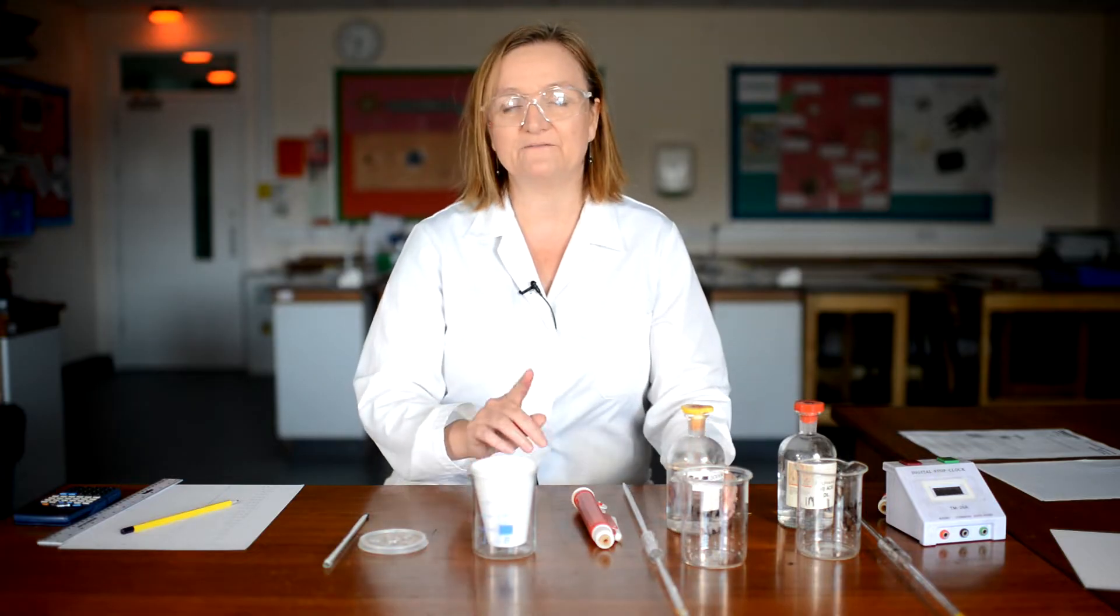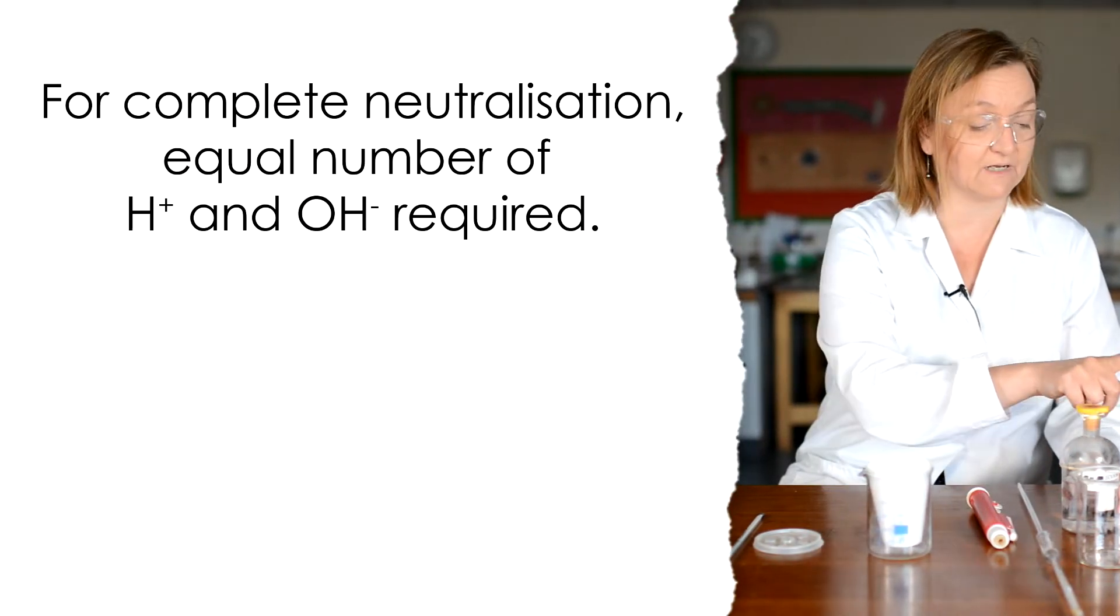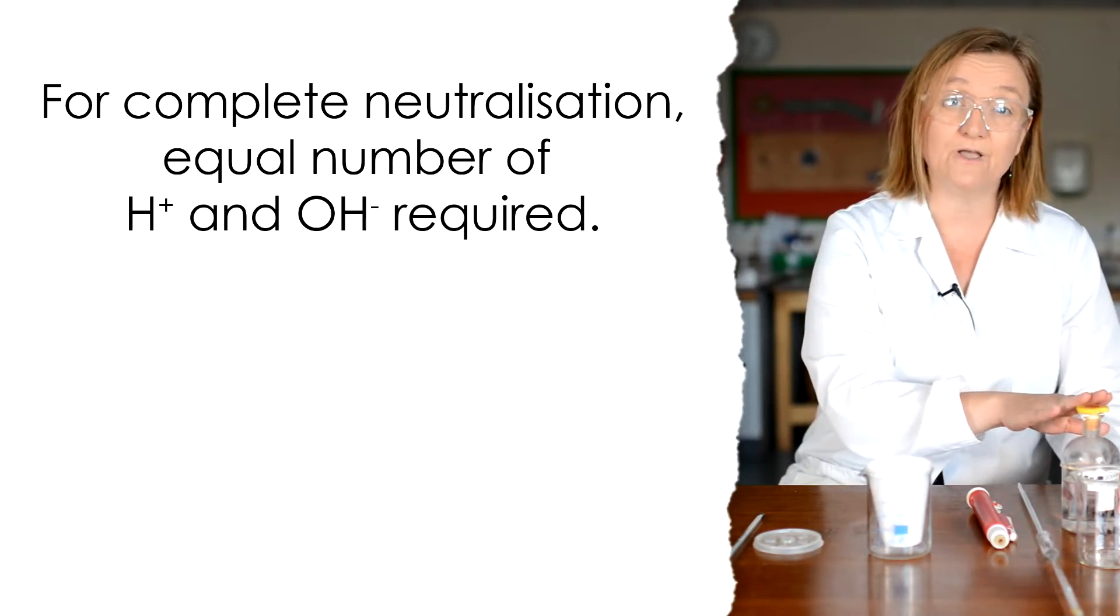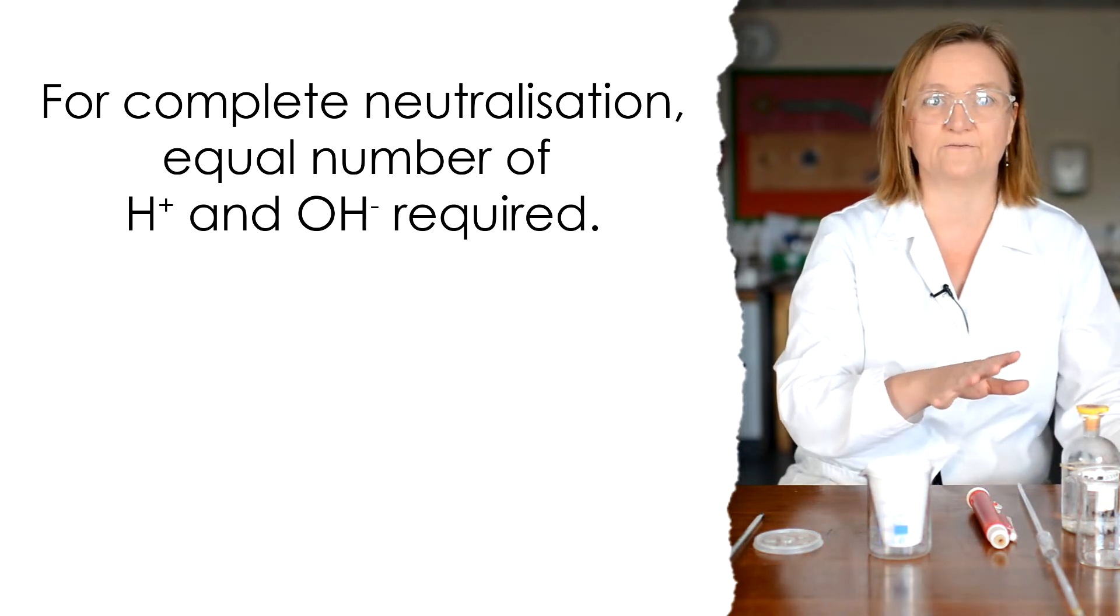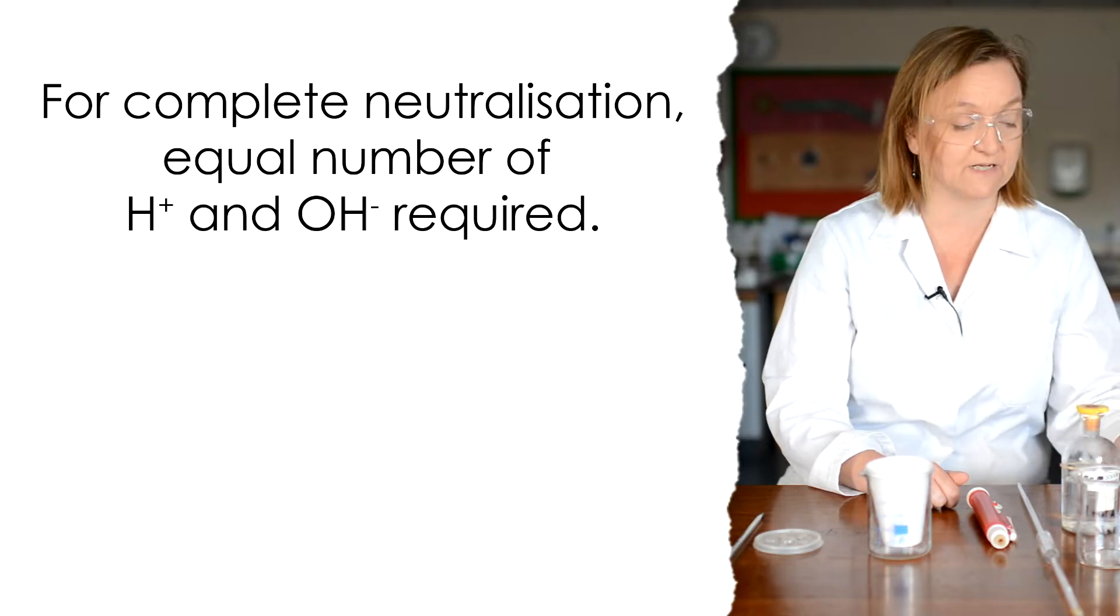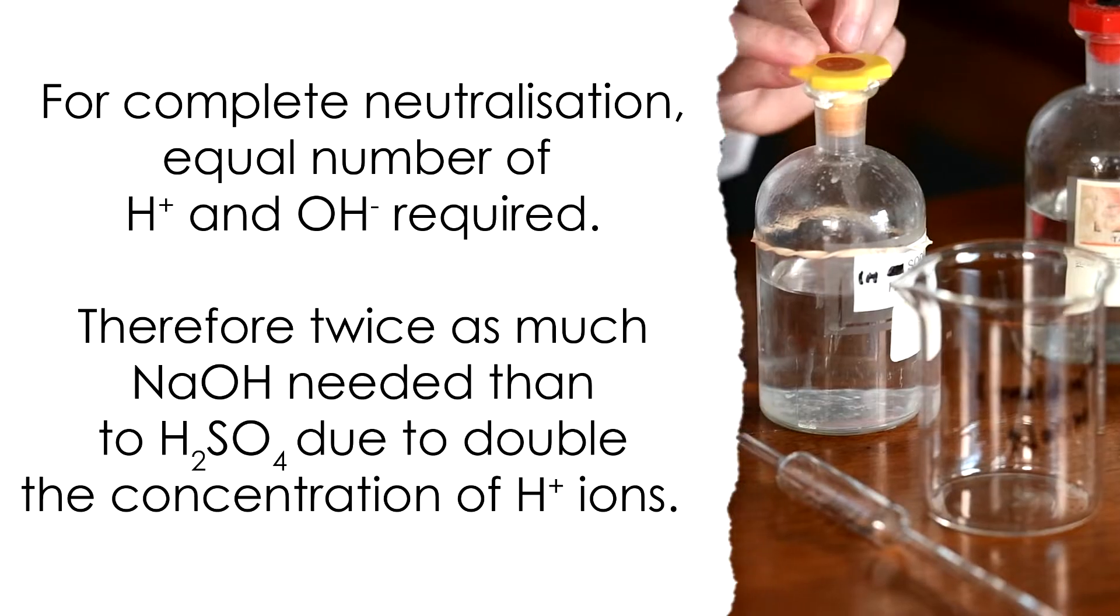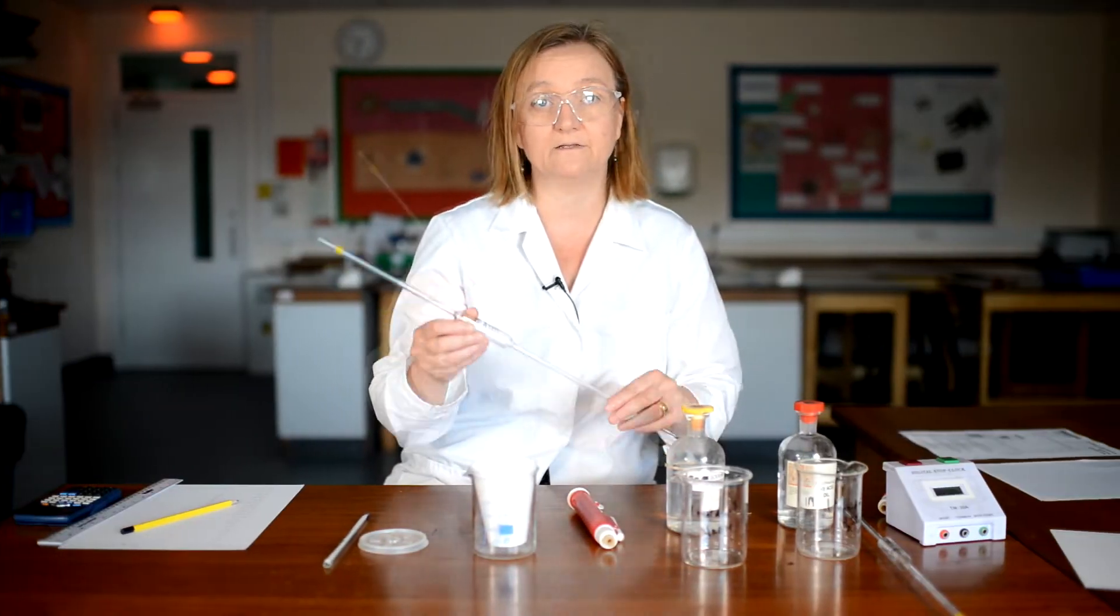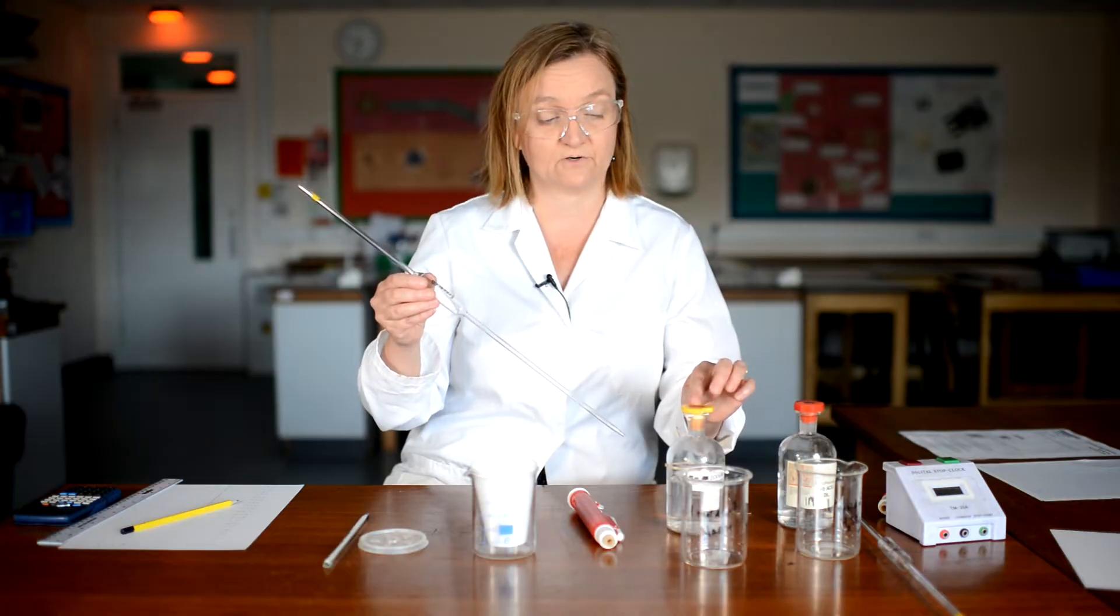So I'm going to start by putting some sodium hydroxide into my polystyrene cup. Now if you think carefully about the stoichiometry between these two solutions, the alkali and the acid, you'll know that because sulphuric acid is H2SO4, therefore releasing two hydrogen ions when it dissolves in water, I'll need twice the volume of my sodium hydroxide.